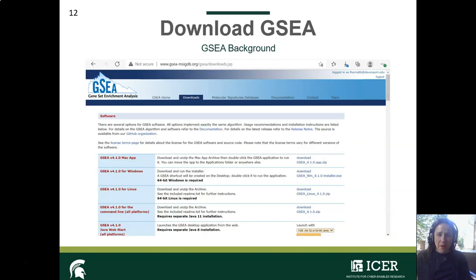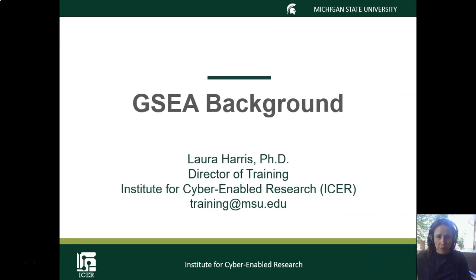The other really cool thing about GSEA is that it's user-friendly and it's easy to download. You can download it from the Broad Institute at www.gsea-msigdb.org. It's available in Mac, Windows, Linux. You can install it on ICER's HPCC, for example. There's a Java version. You can have R packages, you have Python packages, so it's everywhere, and as I said, relatively used widely with human genomes.